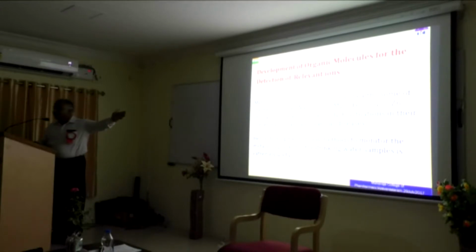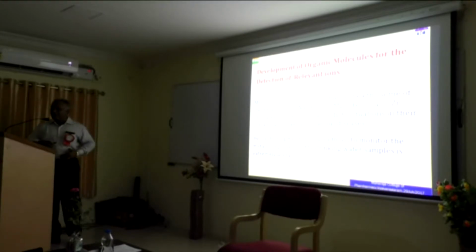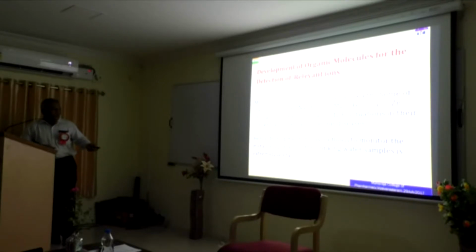So for that, you have to analyze the presence of cations or anions. So we started looking into that. You can develop a new method, so this is the purpose of it. Hence, development of new methods to monitor the metal ions present in drinking water samples is extremely useful, essential actually. It is not just extremely useful, it is essential. We must know them. Okay, next slide.